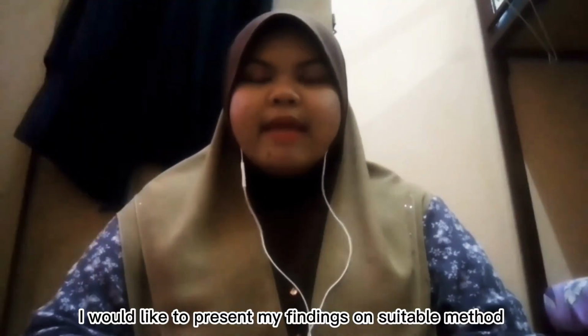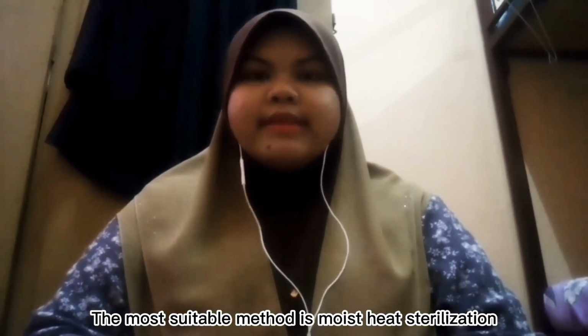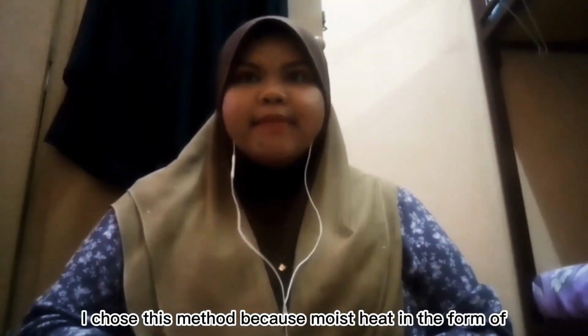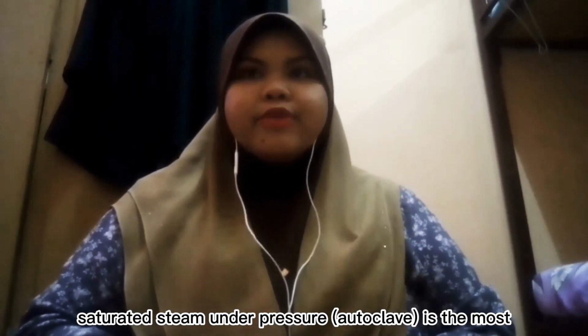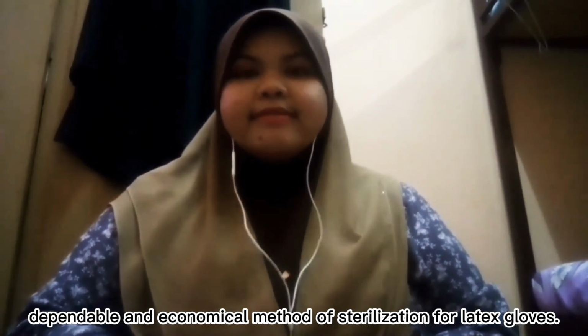I would like to present my findings on the most suitable method for latex glove sterilization. The most suitable method is moist heat sterilization at above 100 Celsius by using an autoclave. I chose this method because moist heat in the form of saturated steam under pressure (autoclave) is the most dependable and economical method of sterilization for latex gloves.